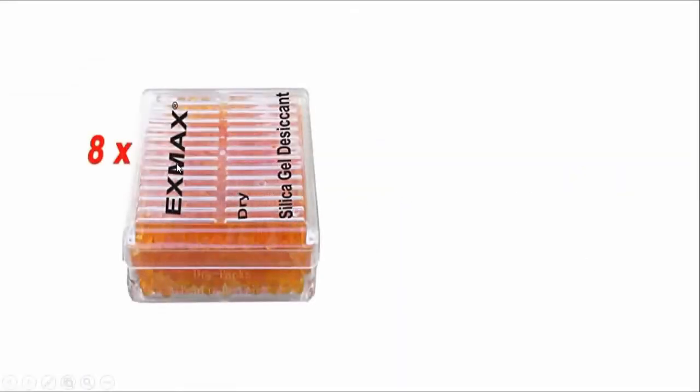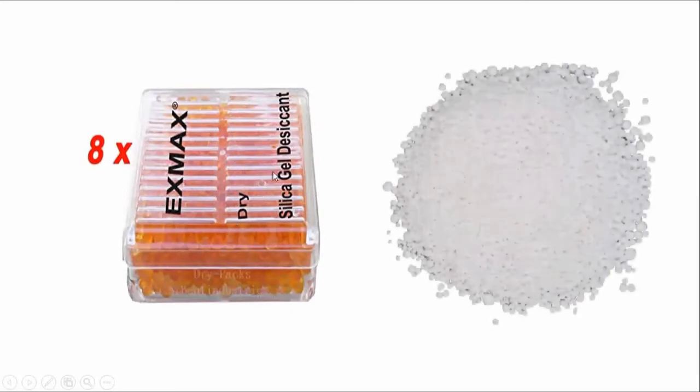This is a picture of dry silica gel desiccant. You might have seen this in many commercial products. And the second picture here is anhydrous calcium chloride. Anhydrous calcium chloride can be found in the laboratories. This again is a desiccant just like silica gel.